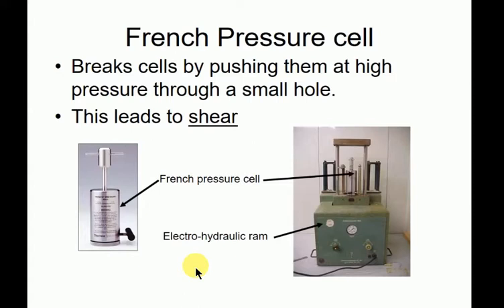As you compress the cells and they come out the bottom, they shear and lyse open, and your efficiency is amazing, right? Because these cells have only got one way to go. Your efficiency of shearing and lysing the cells is beautiful. And they come out the bottom, and you might put them in again. You might give them 2 runs through the machine if you're really desperate, but usually 1 run's enough.